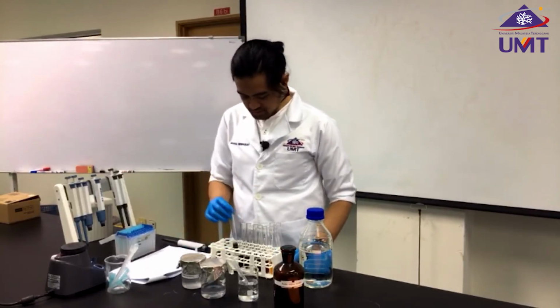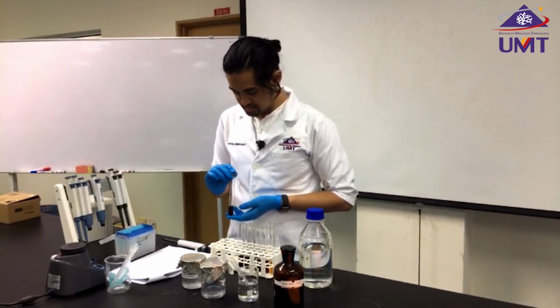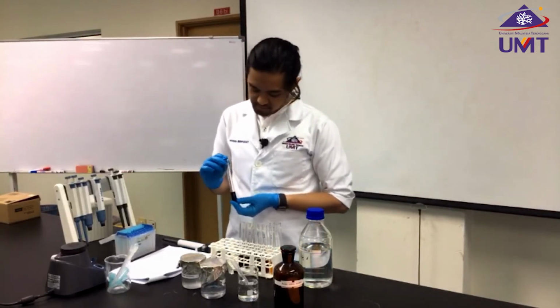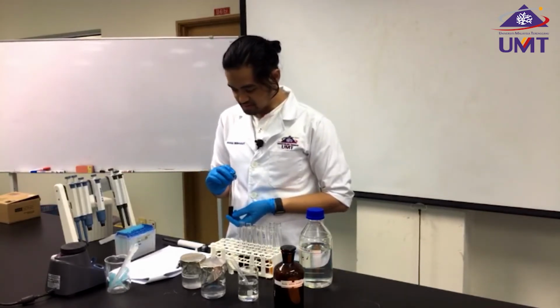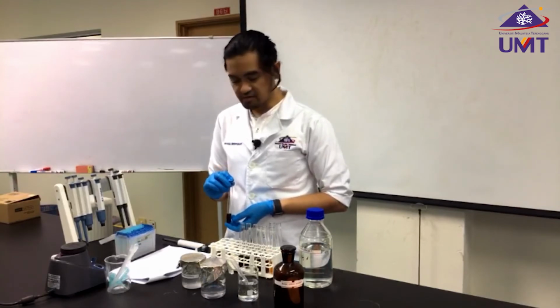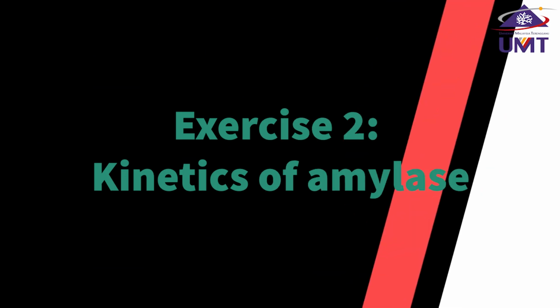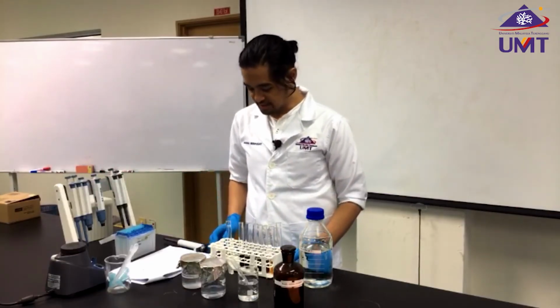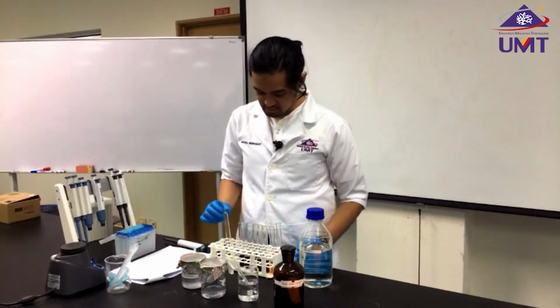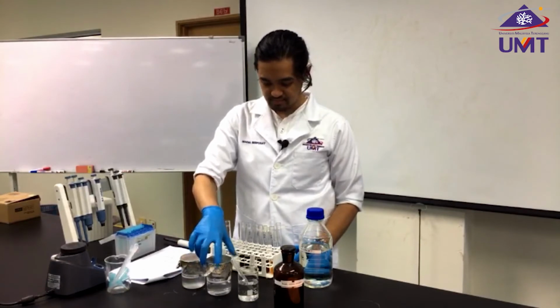So what I need to do now, since I already prepared 1 ml of 0.2% starch solution and added 2 ml of distilled water, and I also have added 1 ml of phosphate buffer. To observe kinetic activity of our amylase enzyme, I'm going to prepare a sample using the starch solution as well.